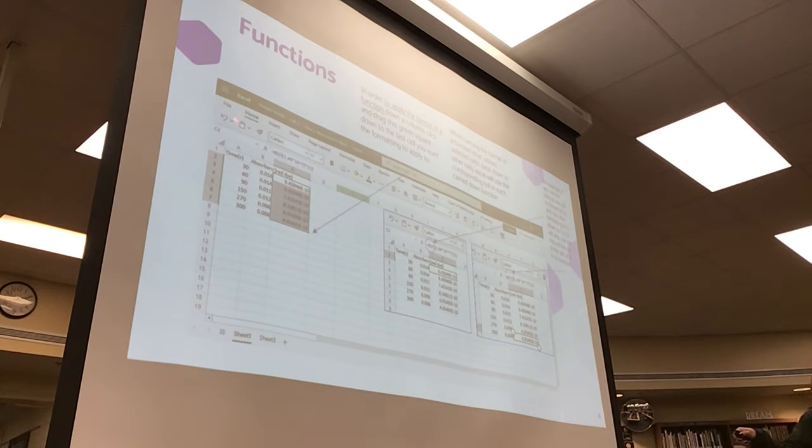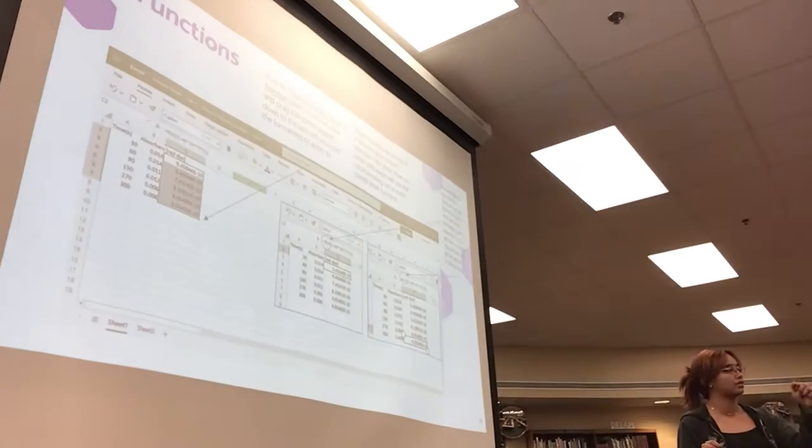You enter the function for the first one, and then you go to your next cell, hit enter, and then enter the data or the result of your first cell, hit enter, and then copy the formatting of that one, so it'll just copy all of that data down.